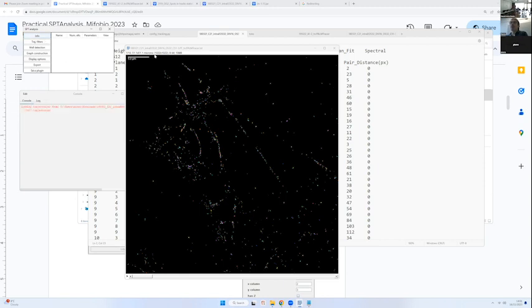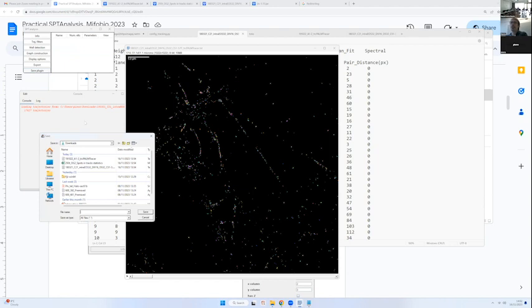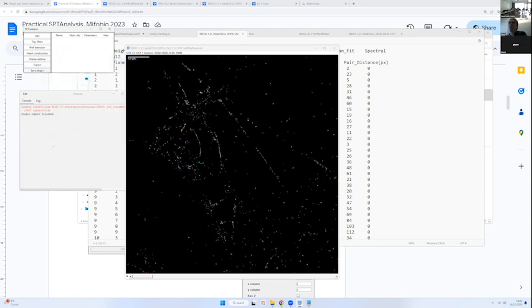Okay. So the thing we can do now, just to make our life easier, is to save this loaded file in plugin format. So just click on Save Plugin and specify a file name, for example, toto.xml. And now we have saved the file in plugin format, and we can just load it directly.